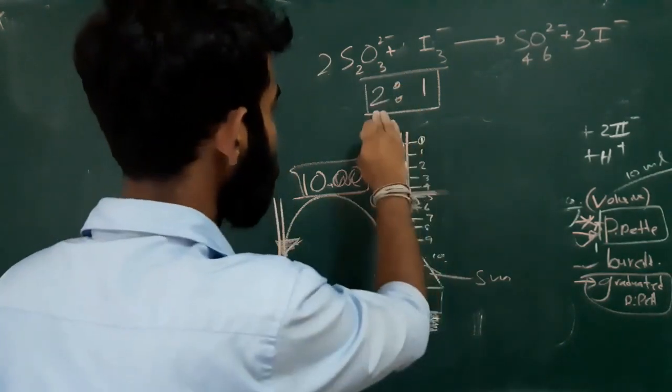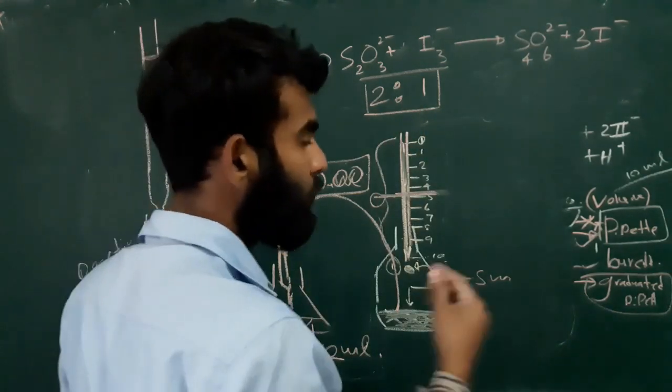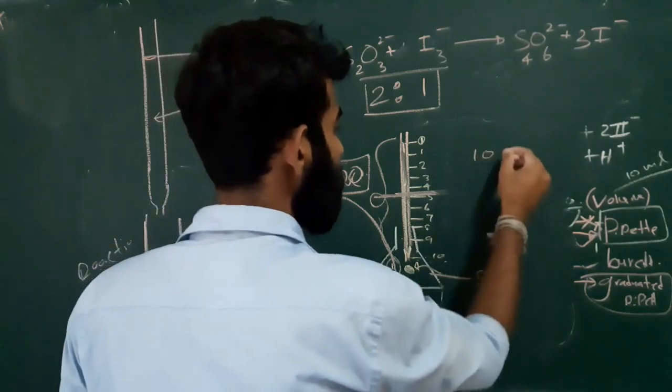The stoichiometry is 2:1. So just like this, you have to do this experiment after 10 minutes.